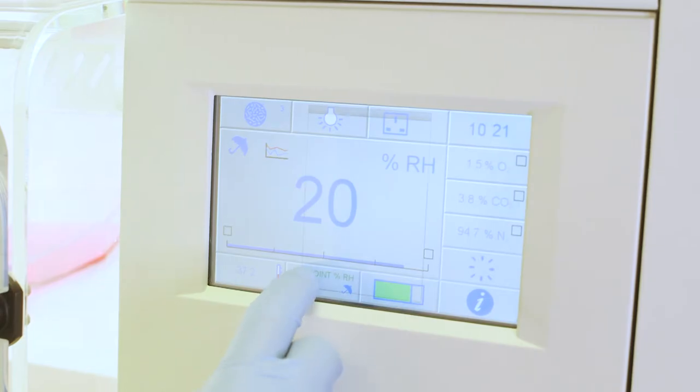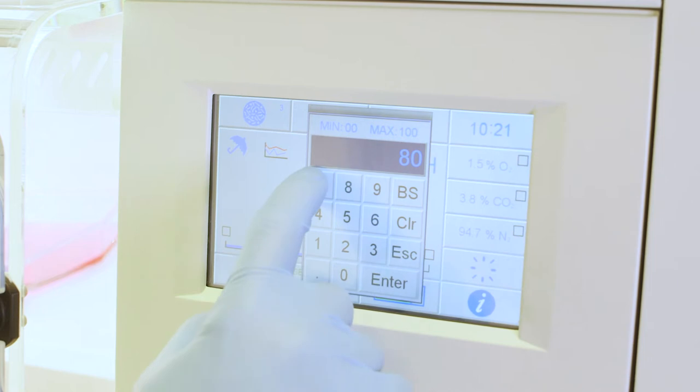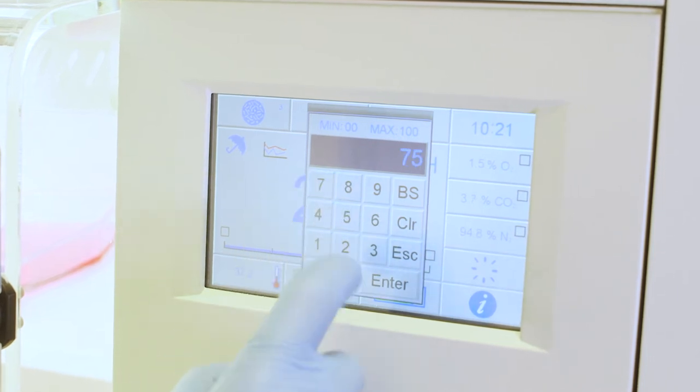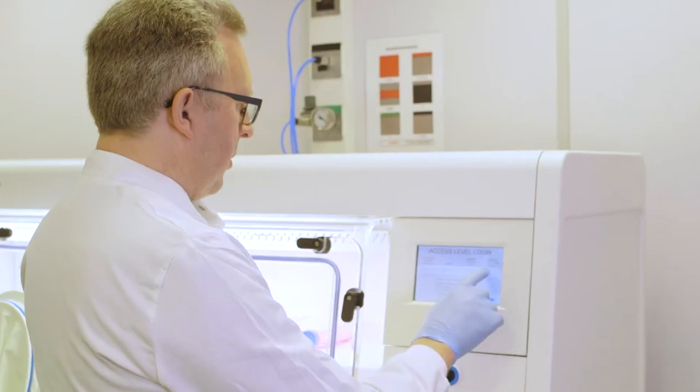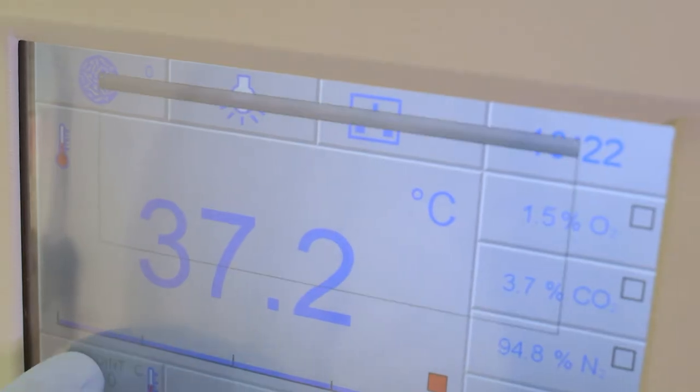Users can adjust temperature and humidity to precise levels, offering further control over the chamber environment. PIN code controlled access levels protect user adjustable parameters.